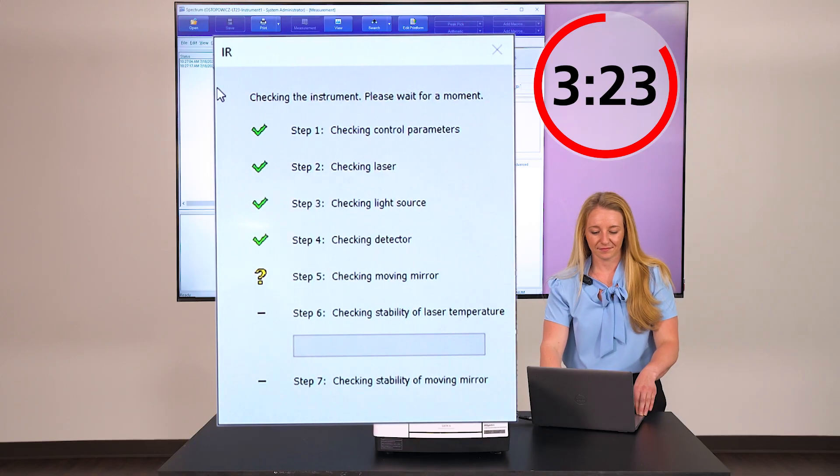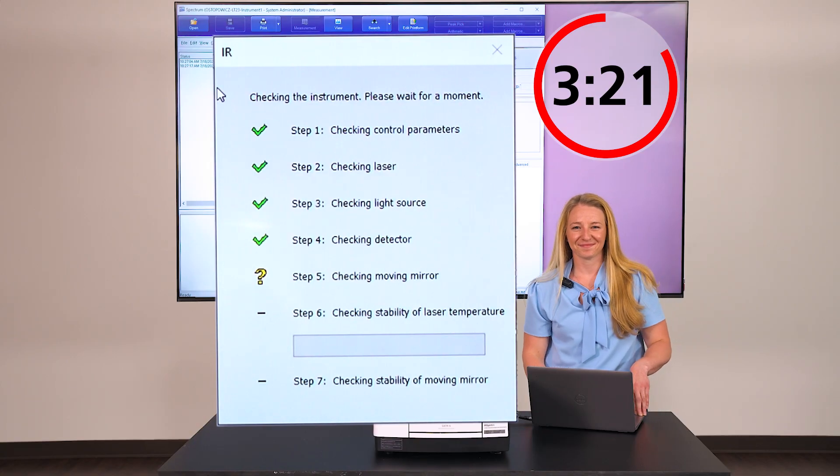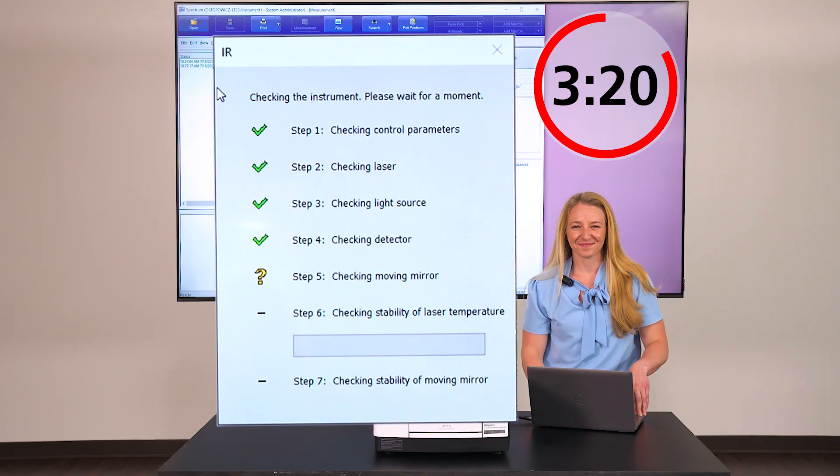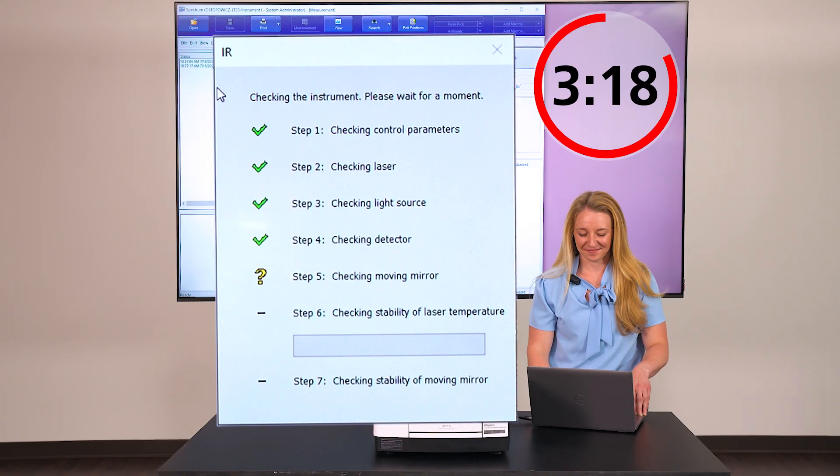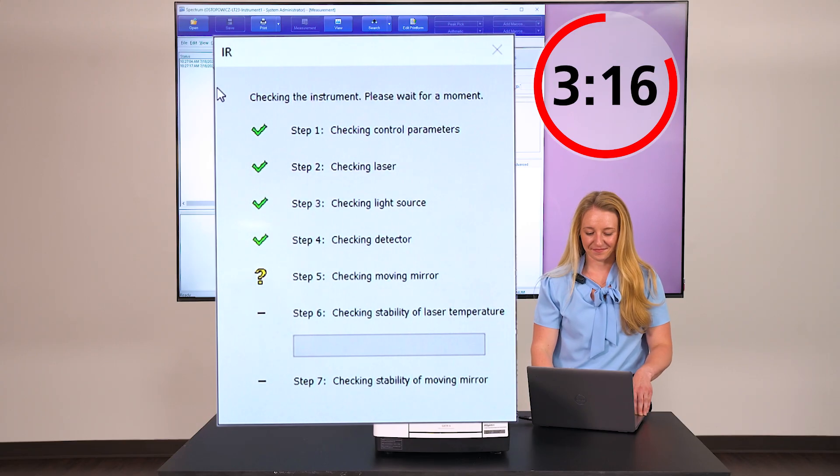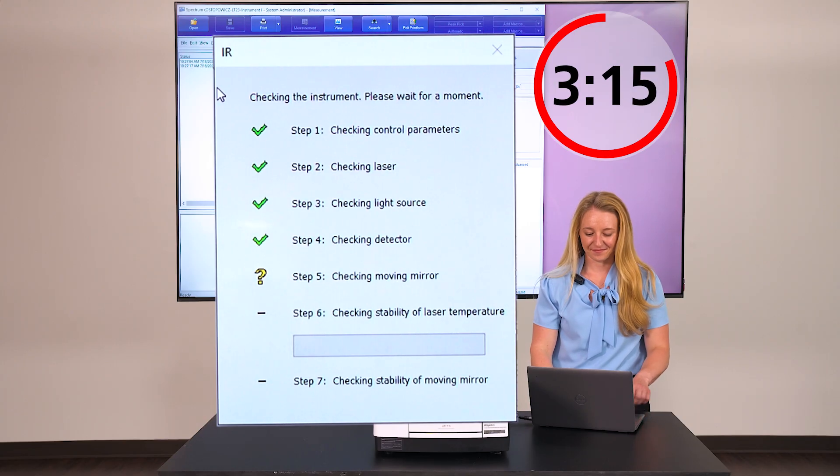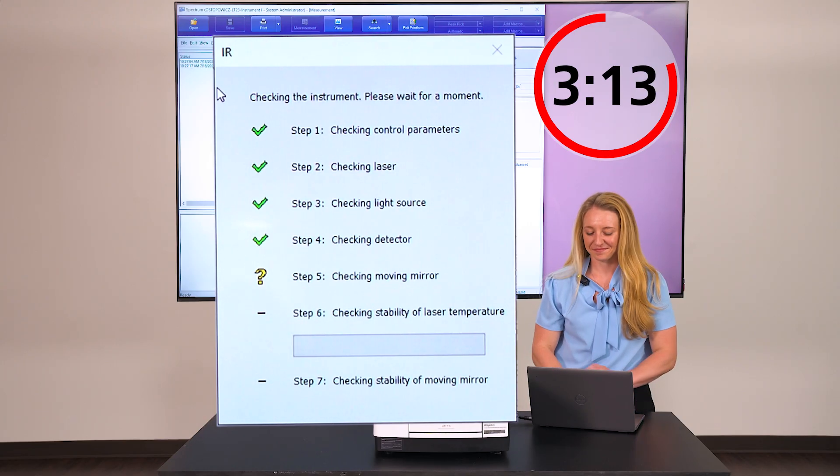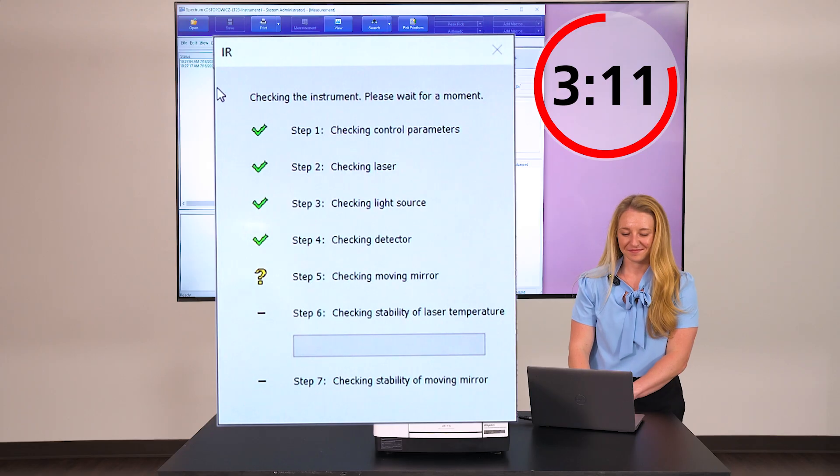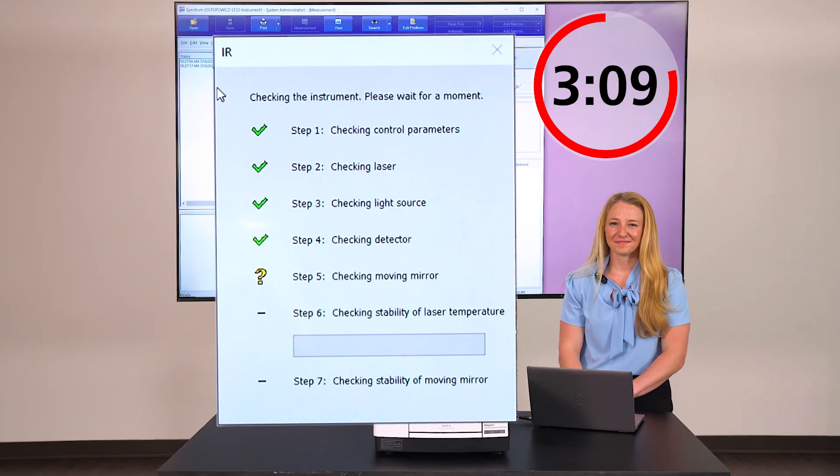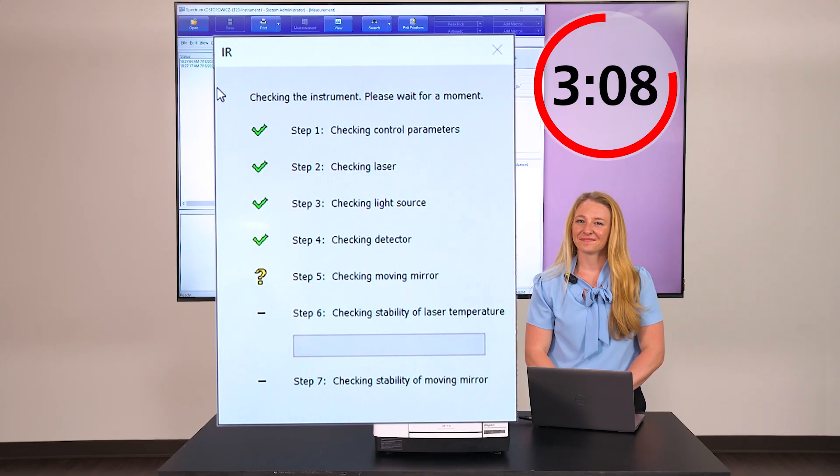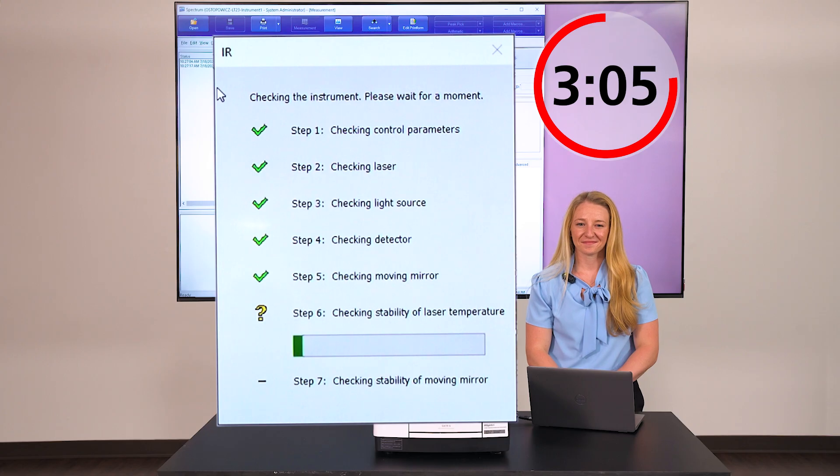Hey everyone, this is Lauren from the future coming to break up the awkward silence and explain the importance of these initialization checks. FTIRs use a Michelson interferometer to create an interferogram, which the Fourier transform converts into a frequency spectrum we're all familiar with. This method exposes the sample to all desired infrared frequencies simultaneously, decreasing analysis time.